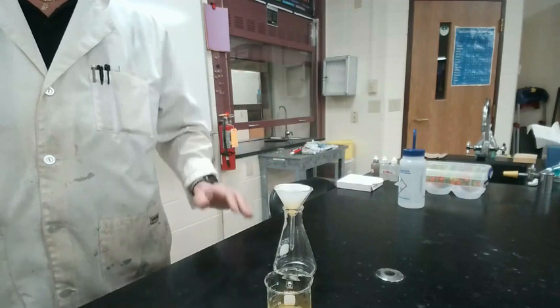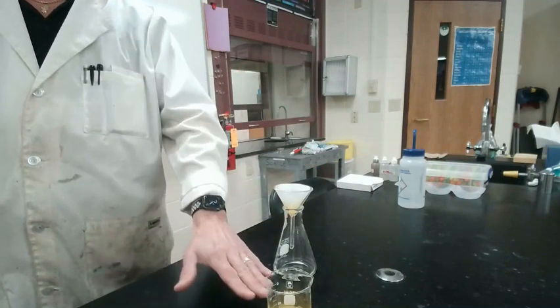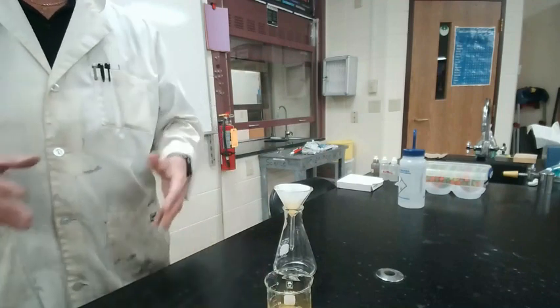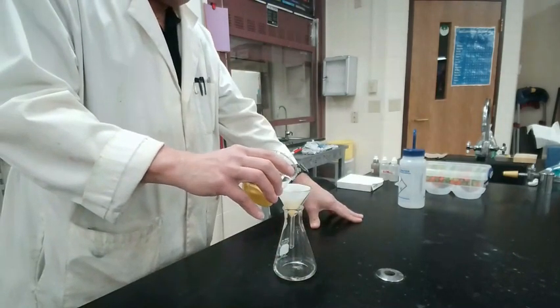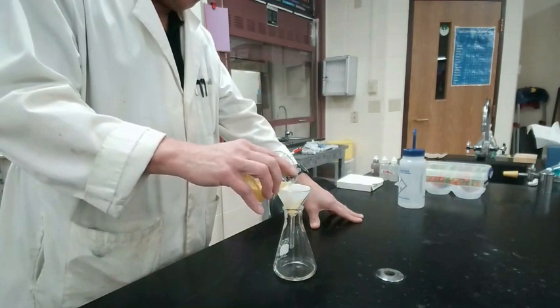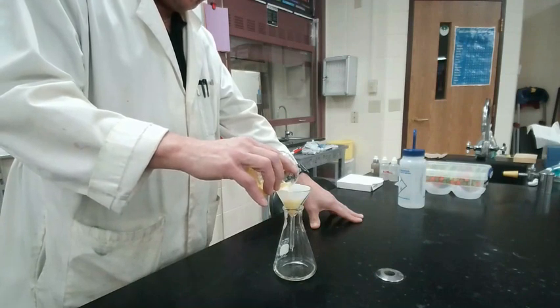So right now I'm letting this filter through. I'm getting the water separating from the precipitate again. In a minute, I'm going to rinse it again. So again, I'm going to take this. I'm going to take and pour it into the filter paper, trying to get just the water, not a lot of the solid.